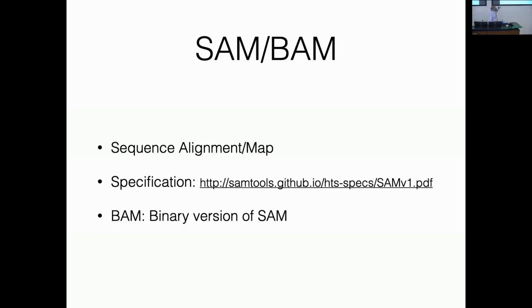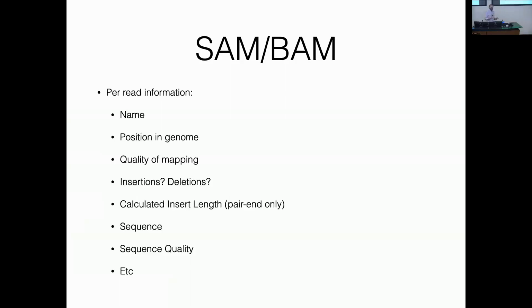But some software will generate SAM files and then you convert it to BAM files. Some software will generate BAM files directly. It's almost never useful to keep SAM files laying around just because they're huge and they're not really useful for direct analysis. So I'll use SAM and BAM kind of interchangeably.